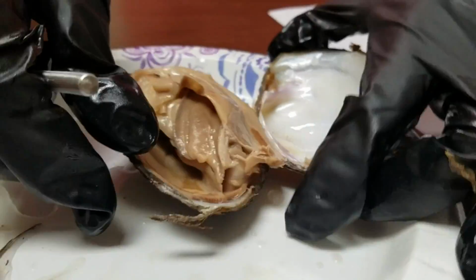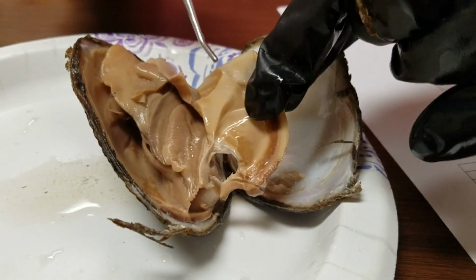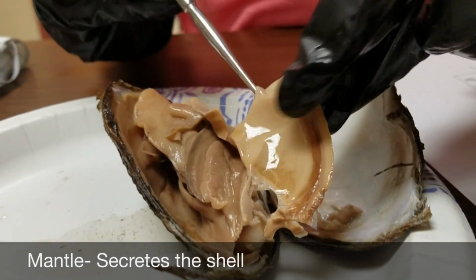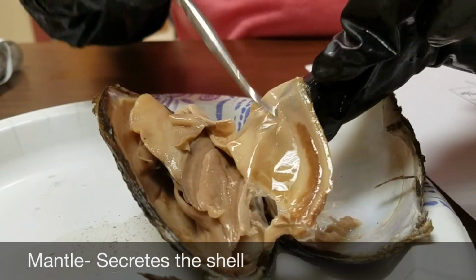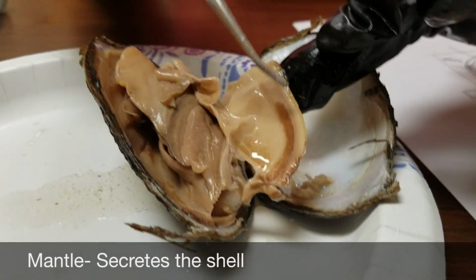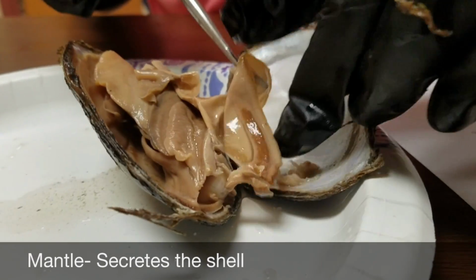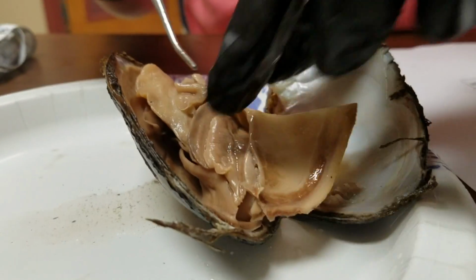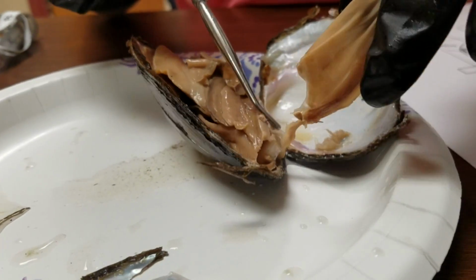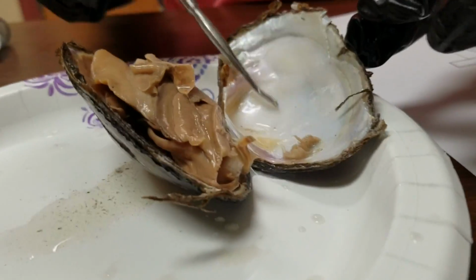So, here is my clam. This portion right here, this is called the mantle. This was stuck to the shell. This is the thing I just peeled off. And this mantle is what creates the shell. So the shell is, remember we talked about growth rings. So the shell is constantly being made at the edge of this mantle here. And I am actually going to kind of just peel this mantle away so that it's not in the way anymore. So there's some mantle. Mantle used to be attached right here on the shell.